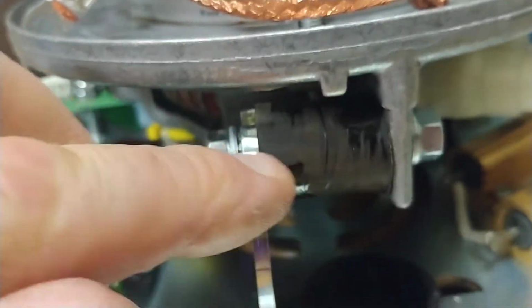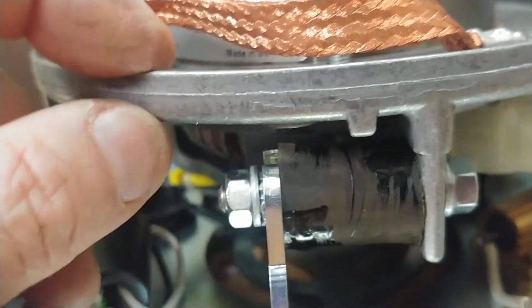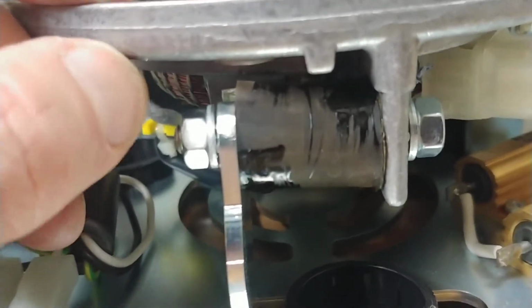So with that rubber cracked, this was sitting lower than expected and banging, I think, right about there, making a non-life-threatening but very loud clattering noise.